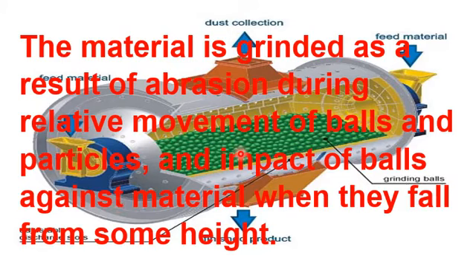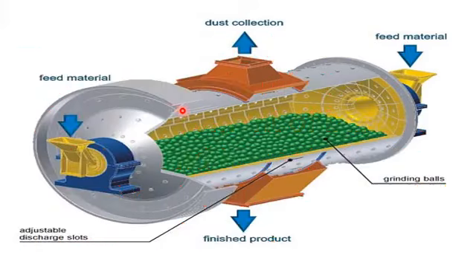Okay, so dear student, it is clear from the name ball milling that the ball milling method consists of a ball and a milling chamber. So this technique involves milling balls which convert a bulk material into a powder, and a chamber in which these milling balls are present.